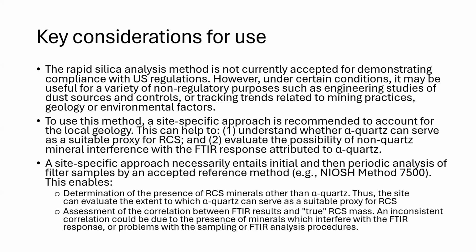This can help to first understand whether alpha quartz can serve as a suitable proxy for RCS, and second, evaluate the possibility of non-quartz mineral interference with the FTIR response attributed to alpha quartz. A site-specific approach necessarily entails initial and then periodic analysis of filter samples by an accepted reference method, such as NIOSH method 7500.